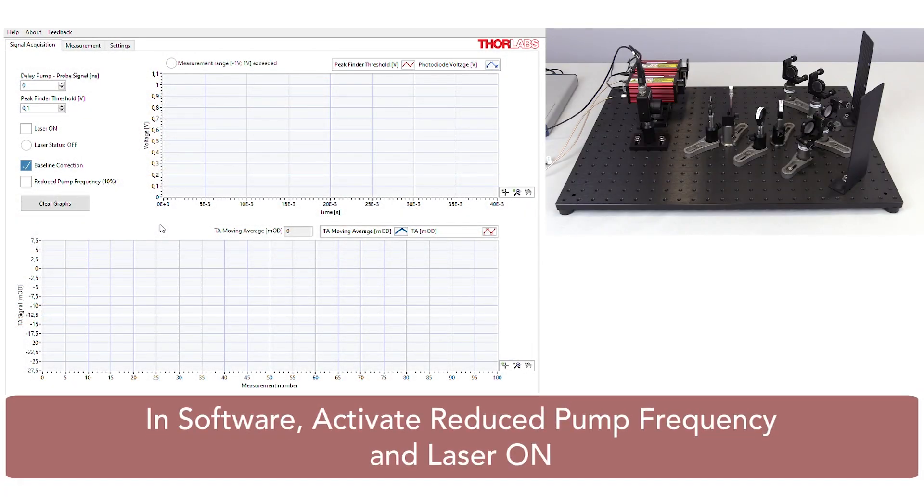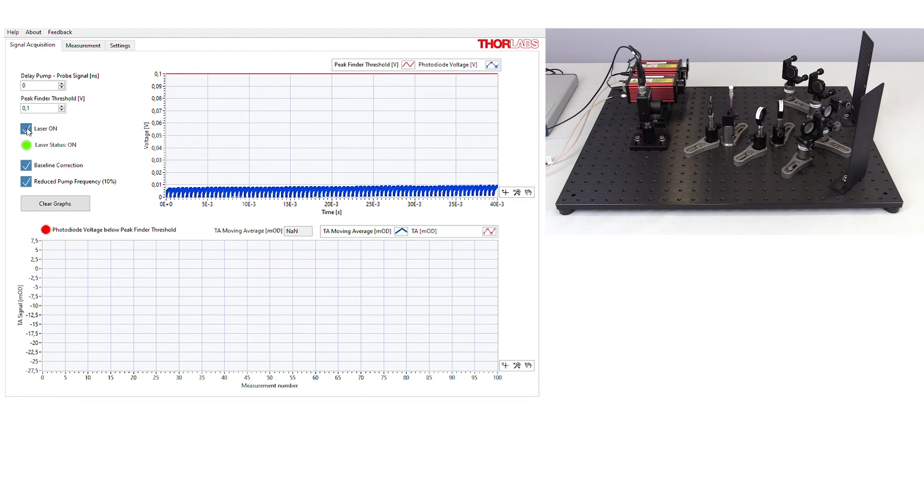Next, open the software for this educational kit. Check the box for reduced pump frequency and then activate the laser. A green circle should appear next to the laser status and the status should read on.